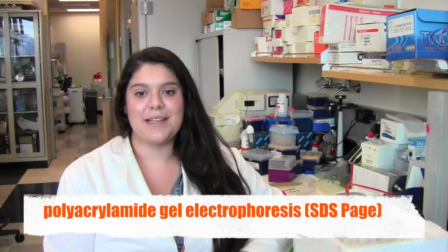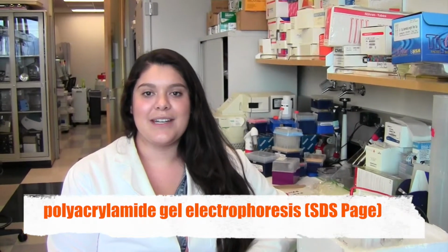Minerva and I'm working in Dr. Ramos's lab in the Medical Research Building. The technique I'm going to be demonstrating today is SDS page.